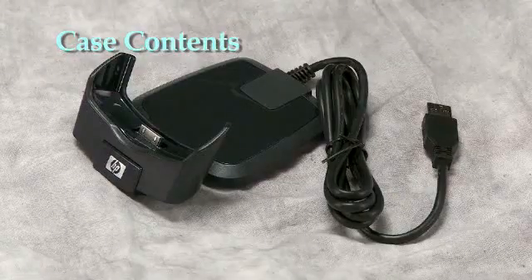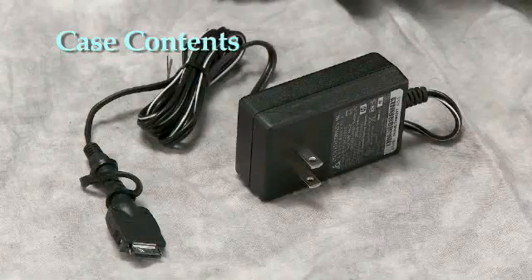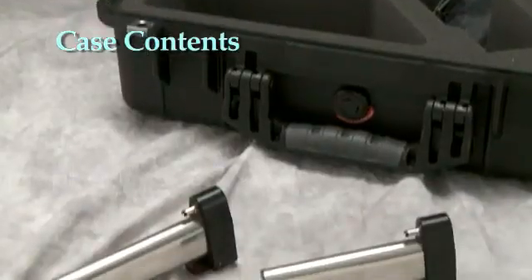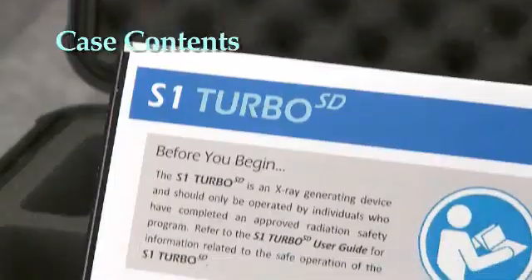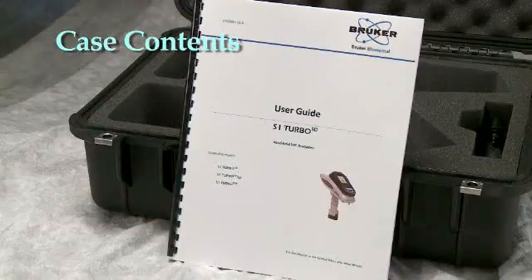A USB to PDA cable to transfer data directly from the PDA to a PC. A PDA charger which can be connected to the PDA while the analyzer is in storage. Two lithium ion batteries. A quick start information guide for the startup of the analyzer. And a user's guide on the operation of the analyzer and its software.